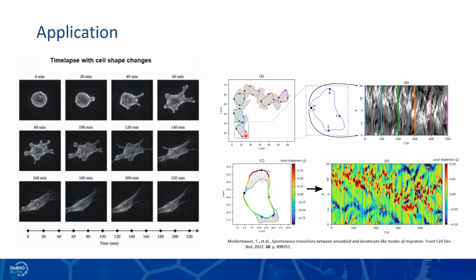After generating cell masks, the contour is parameterized using virtual markers distributed along the cell perimeter from 0 to 2π. These markers along the cell perimeter are then linked across consecutive frames, allowing us to track local displacement changes over time.